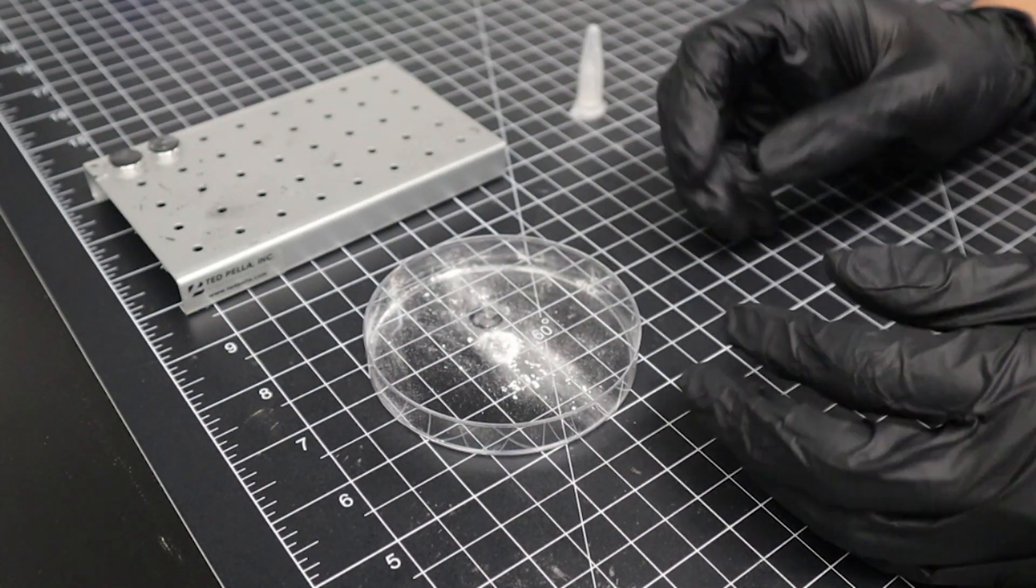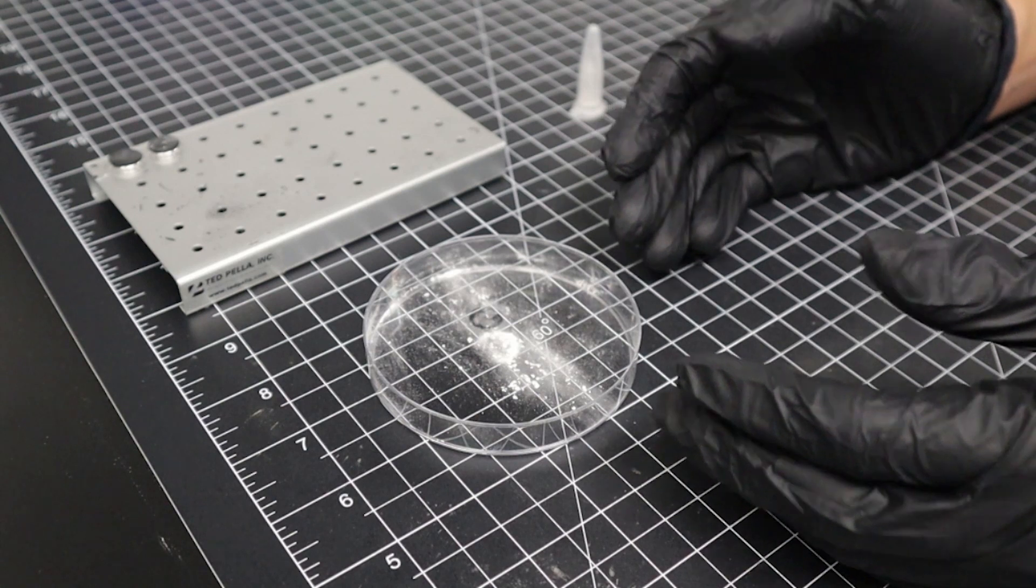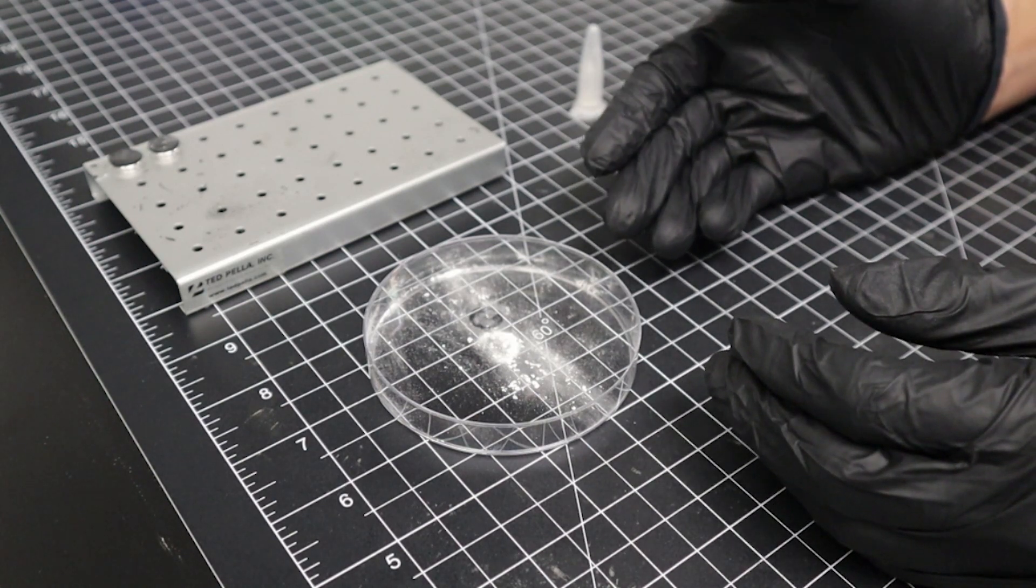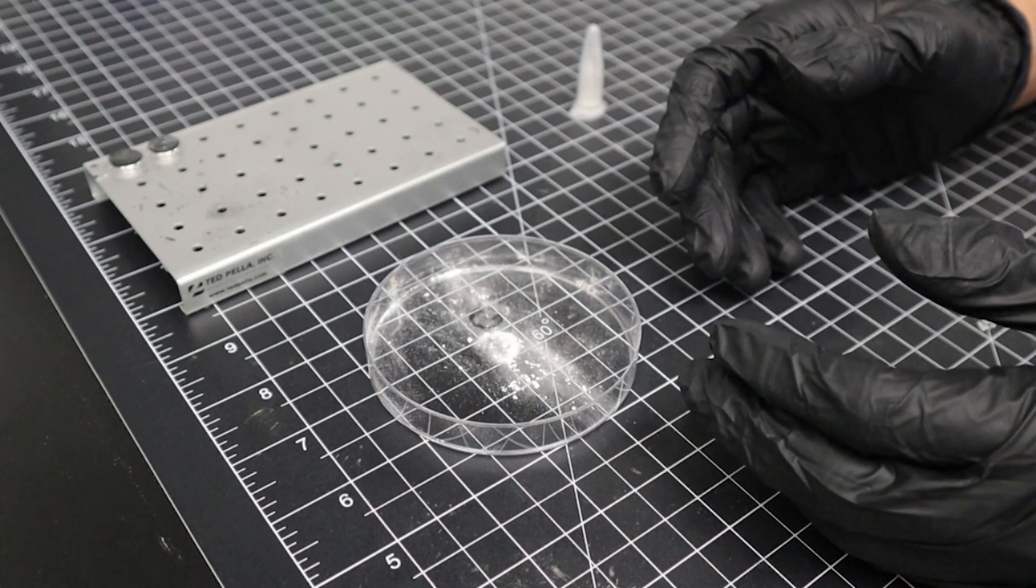The extra powder inside of the petri dish can then be used to prepare more sample stubs or return to its original container. Now let's talk about drop casting.